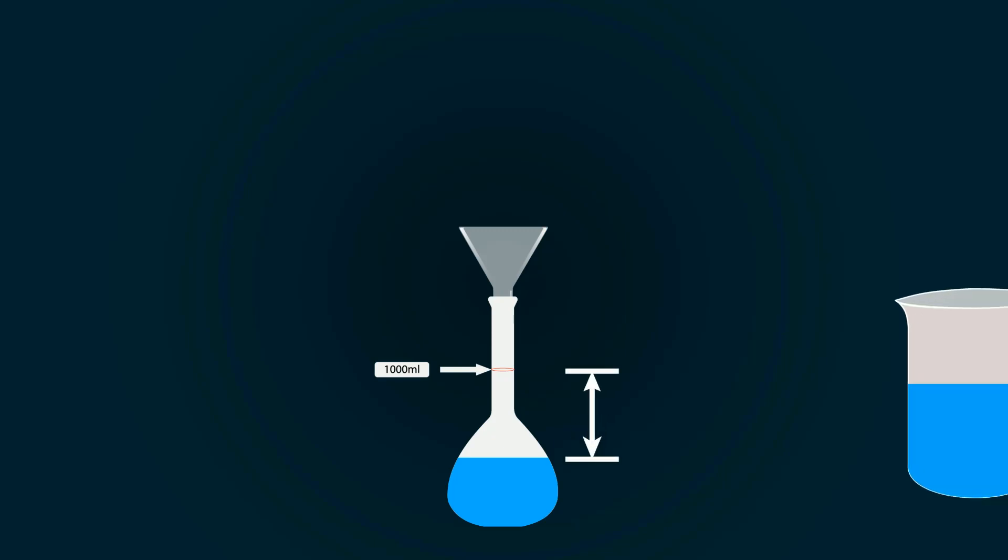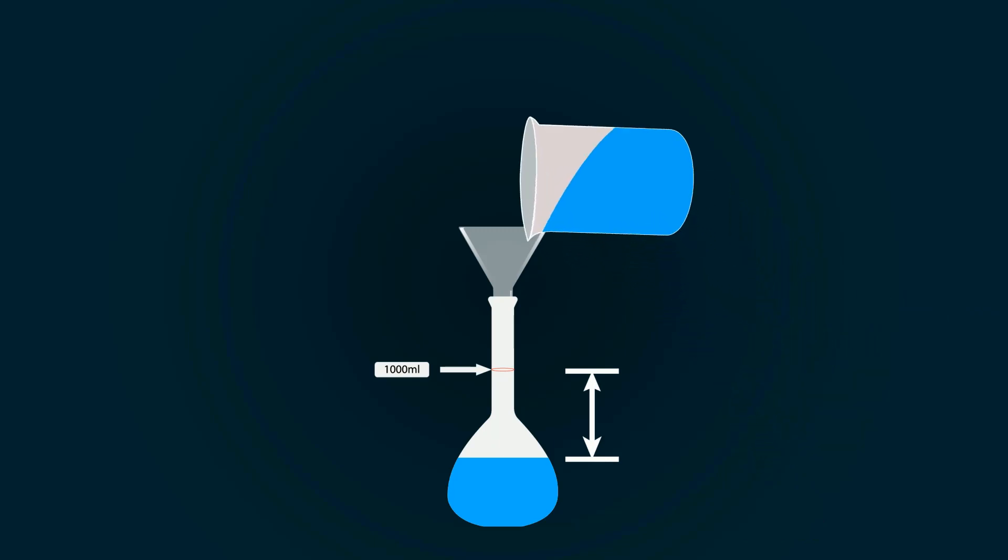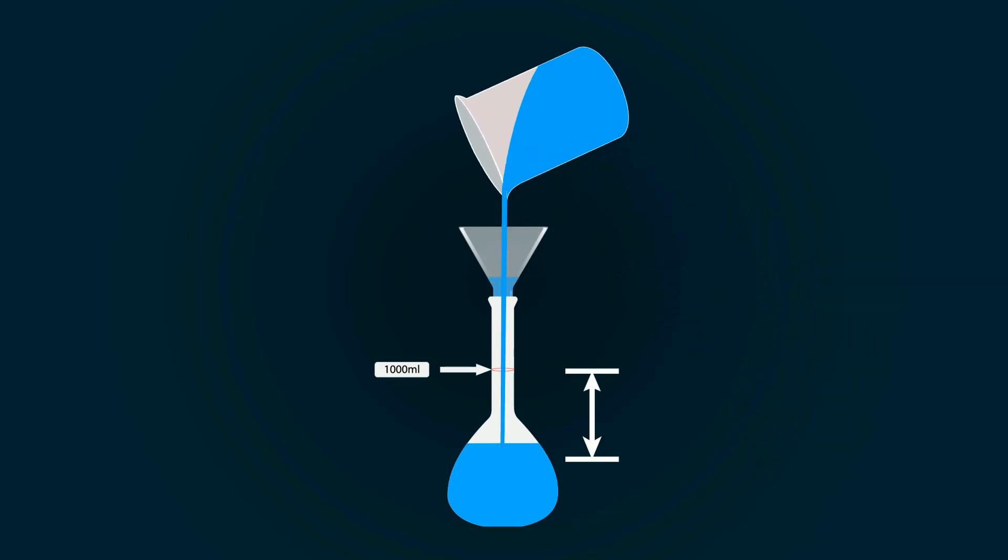So take distilled water into an empty beaker and pour it into the measuring flask to fill it up to the 1000 ml point.